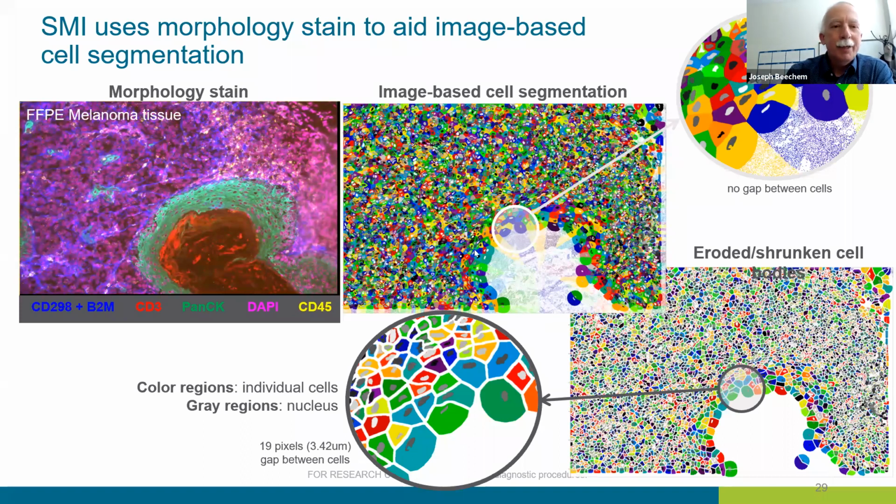Okay. And there's a question about how to hit the membranes. I can't tell you all the membrane targets we hit there, but it's not exactly rocket science at that stage of the game. There's a whole bunch of integral membrane proteins that are pretty much common to almost all the tissues of the body. I think a variety of those. And are we done with our cocktail? Probably no. We'll continue to develop that.